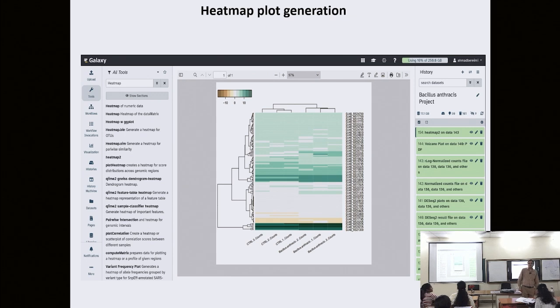So what we have done actually is that we developed a new method published last year. So after you have identified the genes that are differentially expressing, for example, in this bacterial strain, even before doing that, we make a gene network, which I think Sravani you are working on. So we make a gene network from RNA-seq data of this species representing many different conditions.